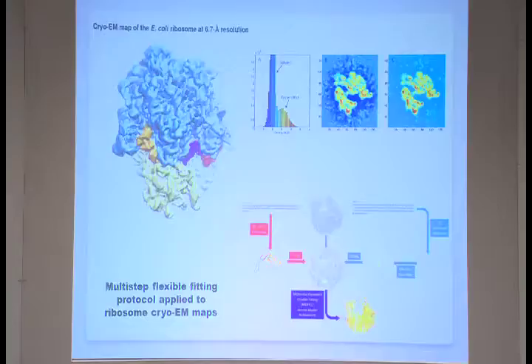And you have to use a threshold value to remove the values for the water or the background noise, and you start the values from the RNA and protein.